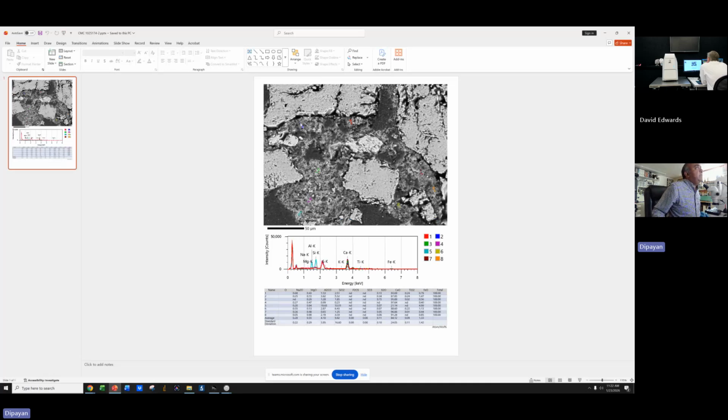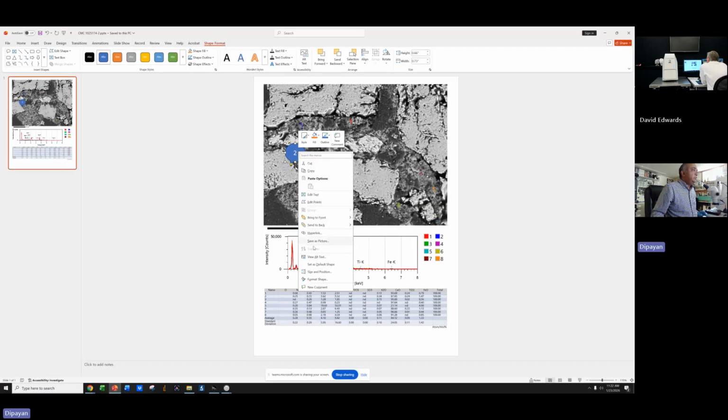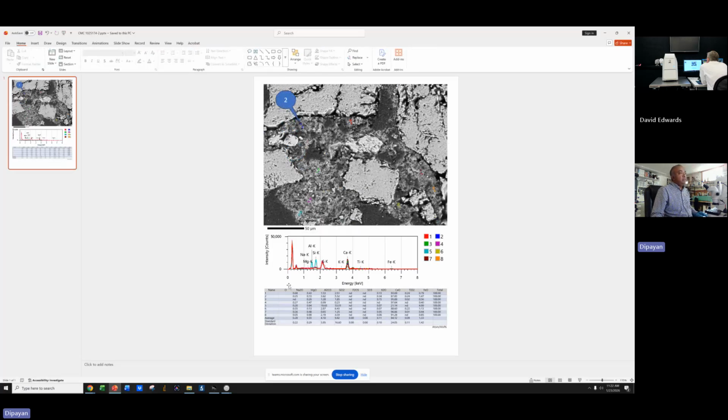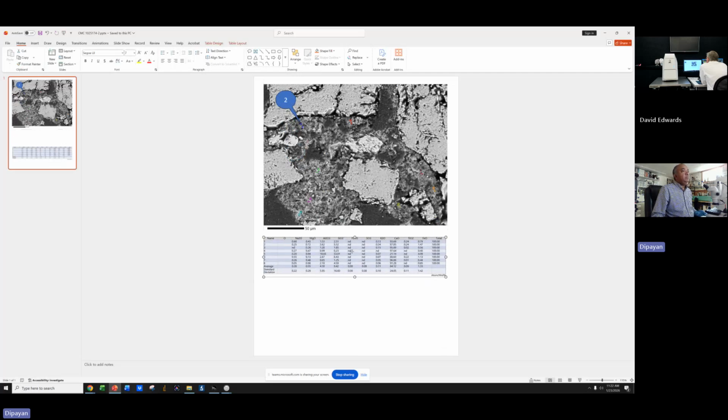I give the map, and then I physically, meticulously draw a point like that. I draw a point, I change this, and then I bring it to my actual report. This is how it goes, and then the data is there. And then I get rid of this whole thing, and then I bring it bigger and closer. That's how my final report goes.